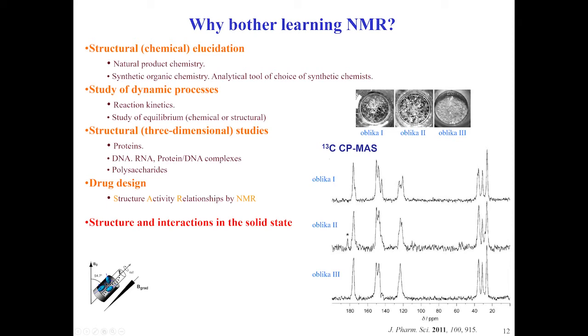It's more cubic size or more like a dusty place, not crystalline. But when you want to get insights, what sort of hydrogen bonds are formed and how do these assemble, you see that carbon NMR shows you these differences. And of course, this is the first step to go forward and understand how they combine.